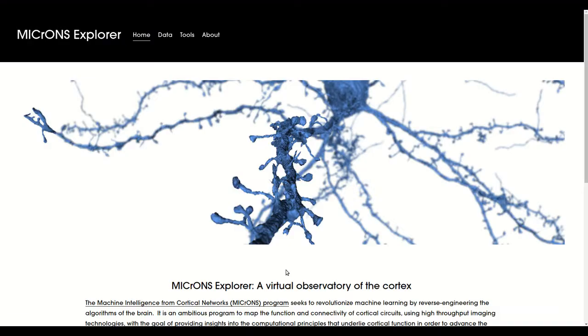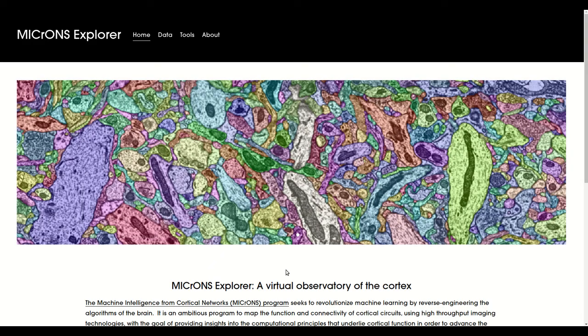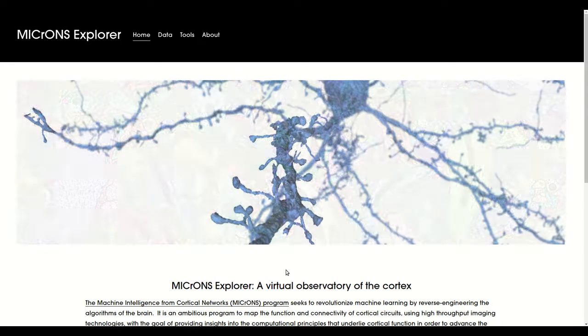Welcome to our tutorial video on our public MICrONS resources. I'm going to take you through a brief introduction of how to visualize the data we've released on the MICrONS Explorer website, and we'll also take a brief look at the open source analyses we've released on MICrONS Binder.